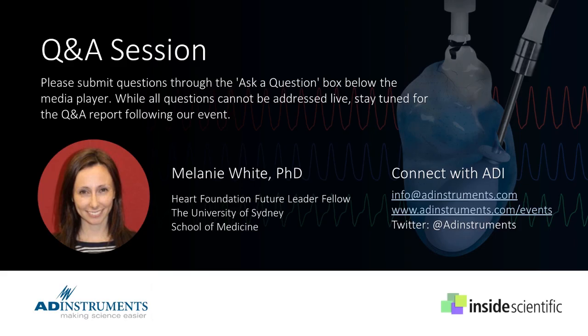Perfect. Okay. Now, here's a good question that came in actually during registration. Gonzalo Peluso said, it takes me 3 minutes between euthanasia and starting the perfusion of the isolated heart. Do you think this is a good time in order to reduce the damage of the heart because of ischemia?